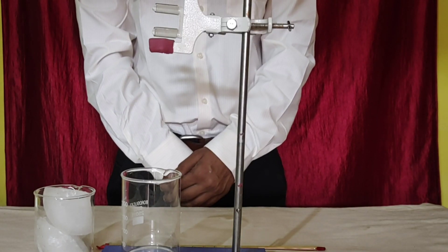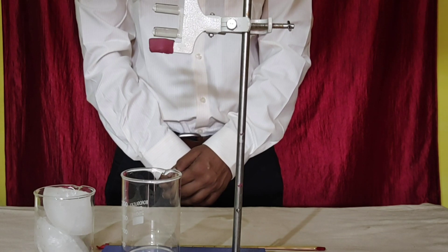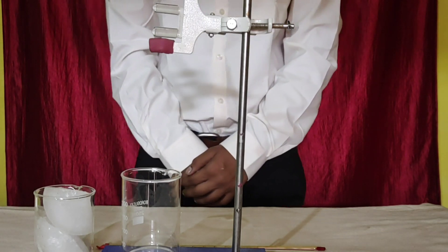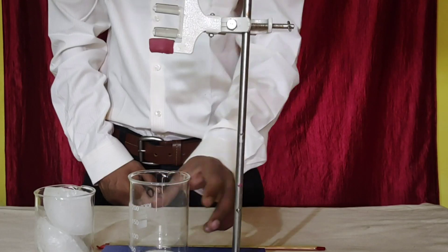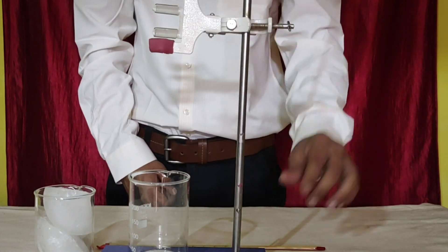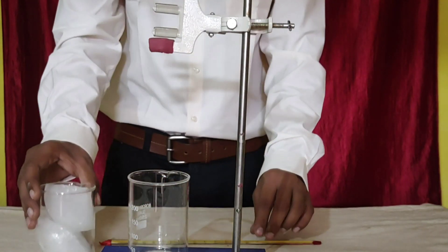Let's perform part B: Determination of melting point of ice. Material required: Beaker, Stand with clamp, Thermometer, and Ice.